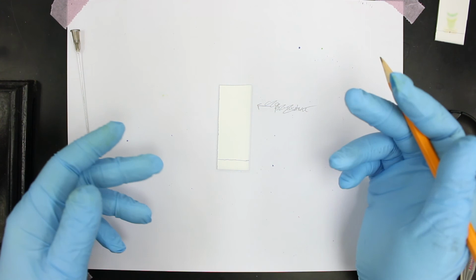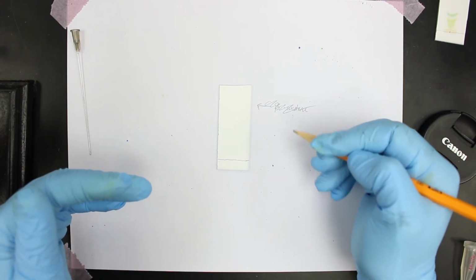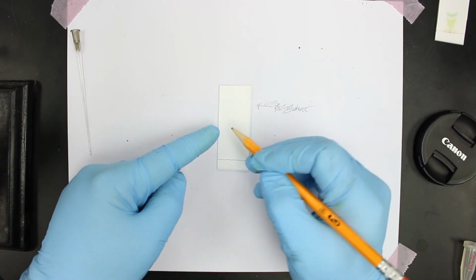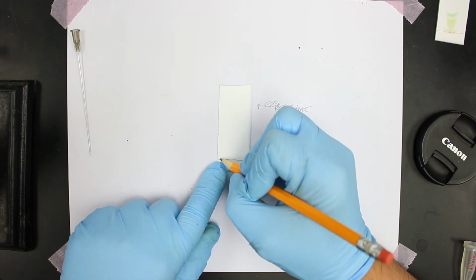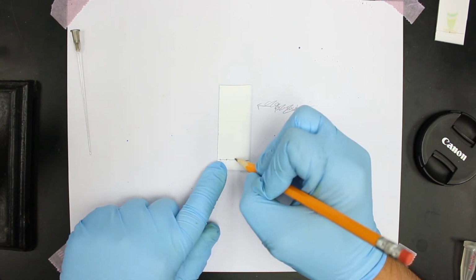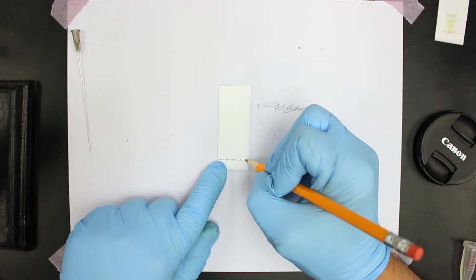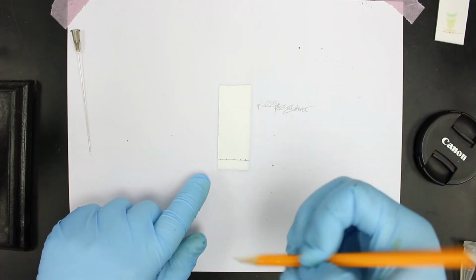And the way we can tell is that if it has a certain compound in it, in the unknown, it'll have the same RF value. So the spot will be at the same distance, and you'll know, oh, it has this inside of it. So let's see if we can fit 5 spots onto our plate here. Okay, looks pretty good. And we can label them.